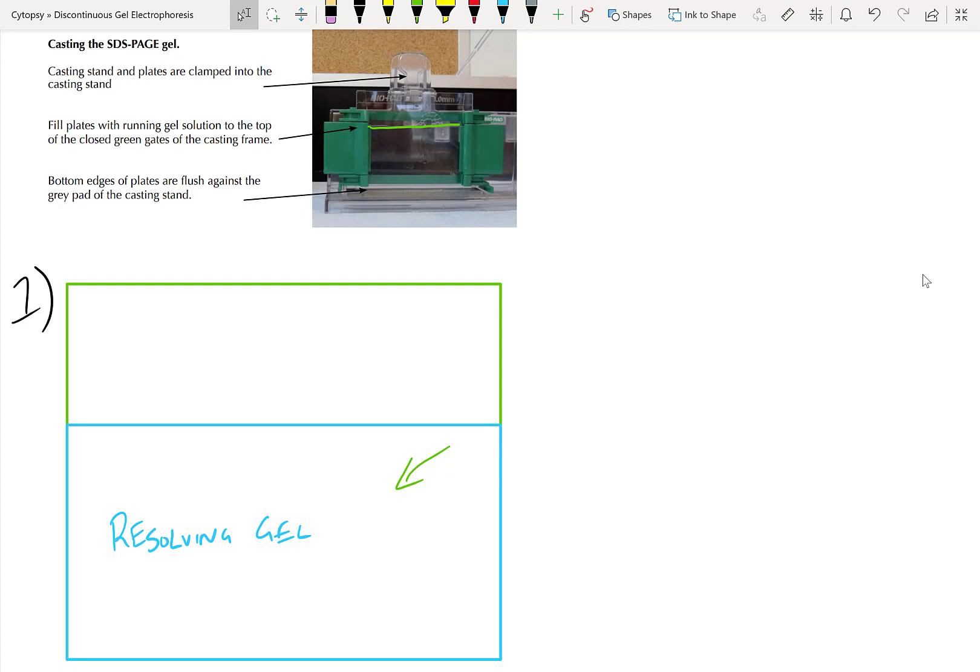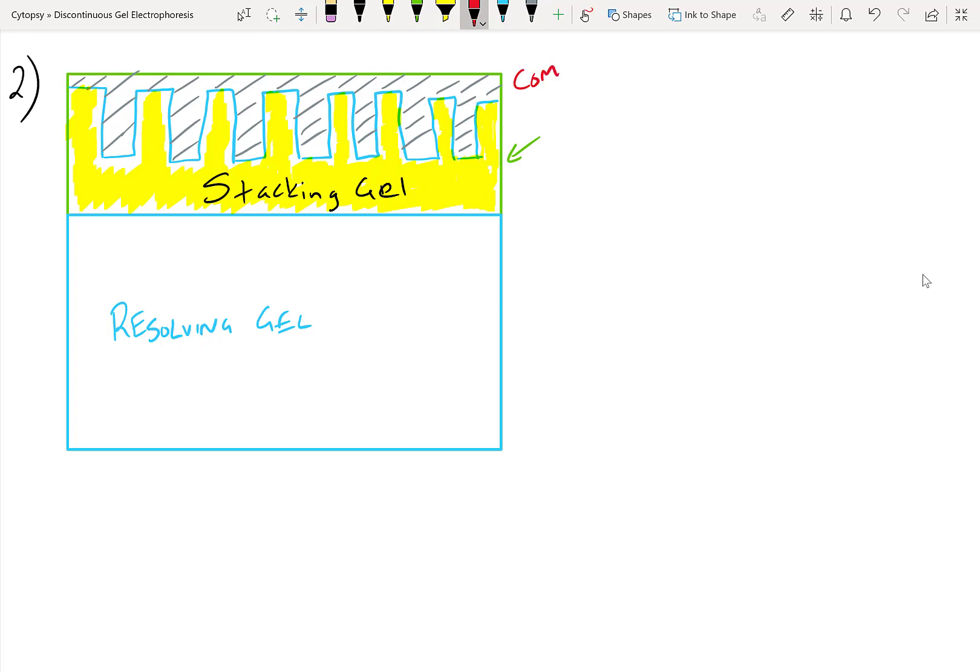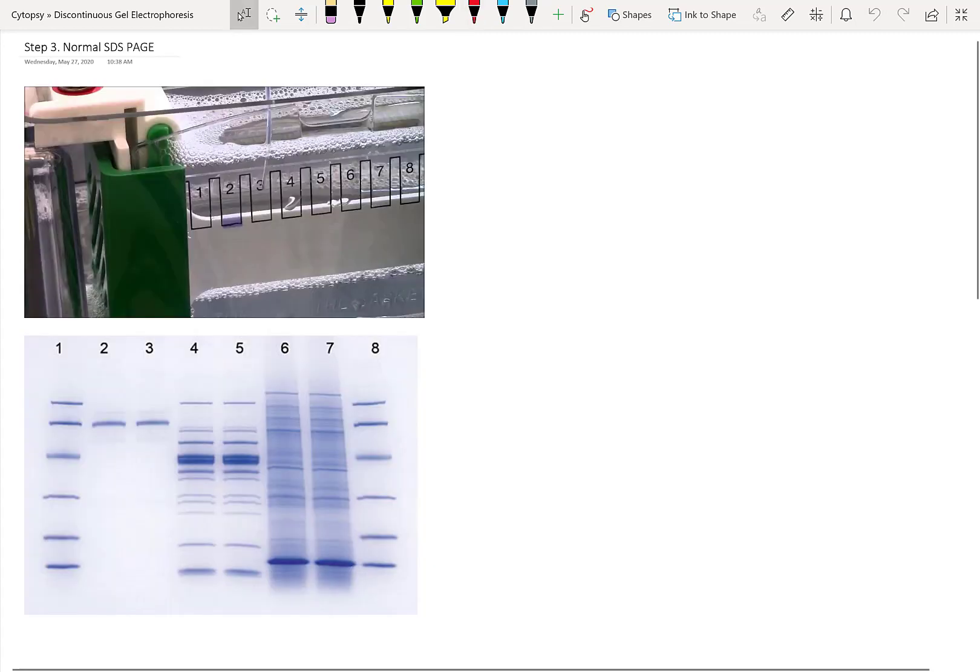And put the resolving gel into your casting apparatus until this line. Don't fill it completely. You still need space for the stacking gel, which you're going to add on top. Once your resolving gel is done polymerizing, now it's time to add the stacking gel. So what we do is we add our catalyst into the stacking gel tube. Then we pour the stacking gel on top and we add our comb, which is this dashed region up above.